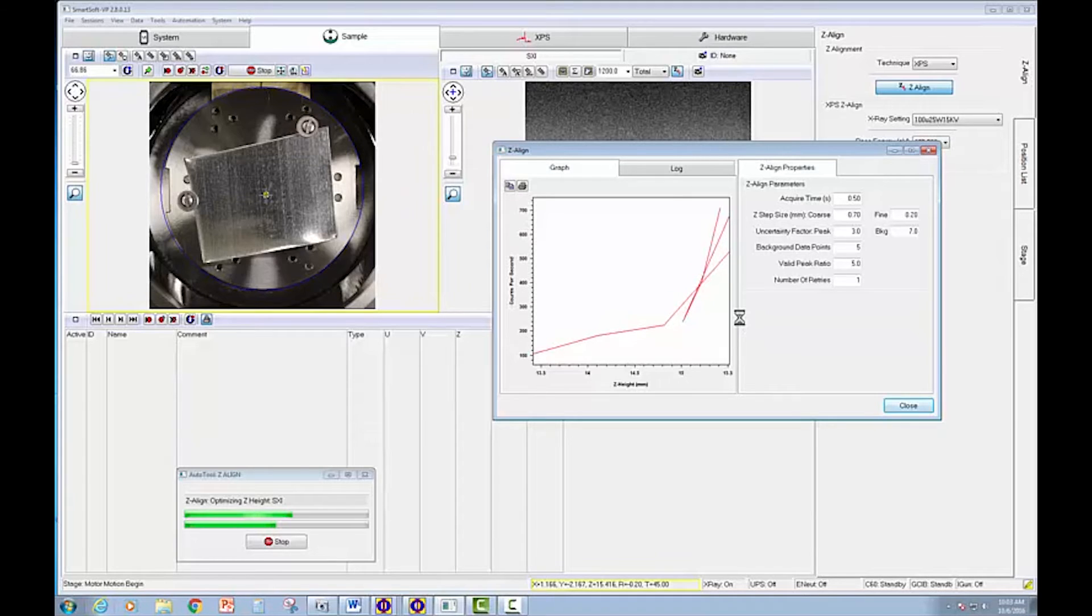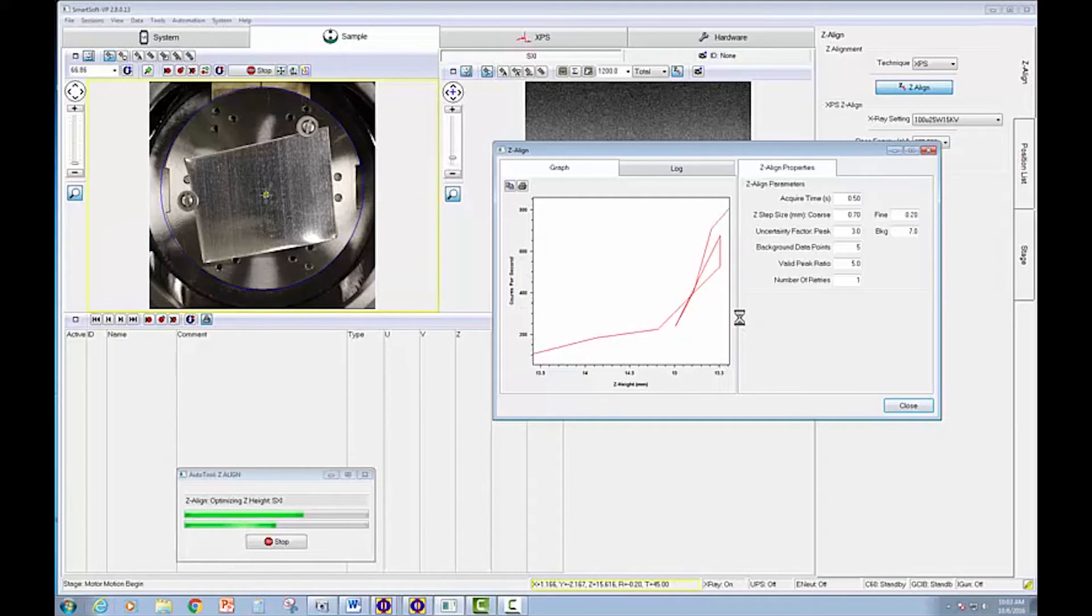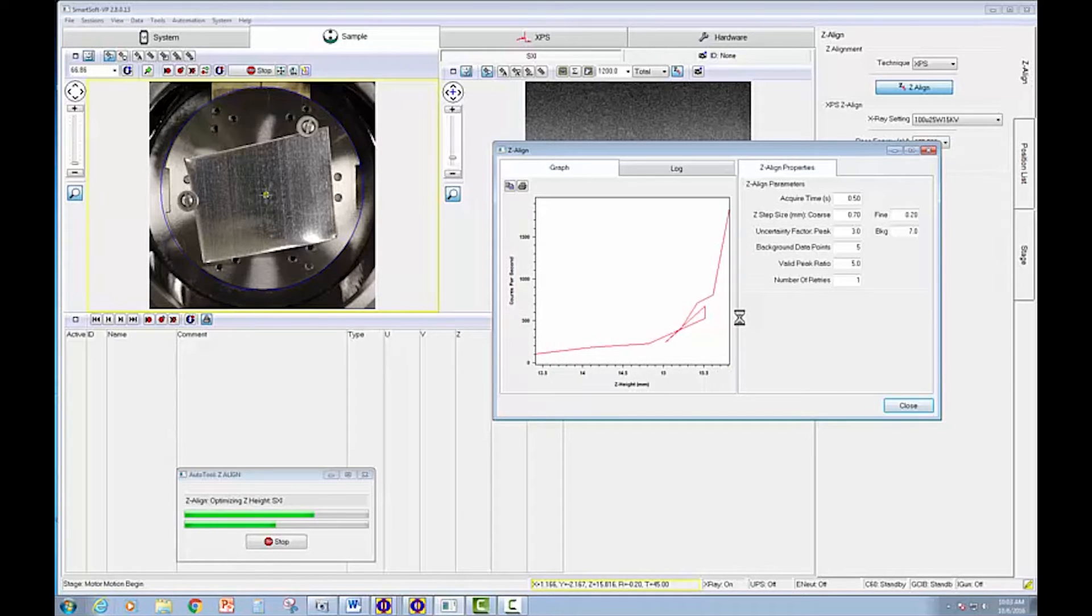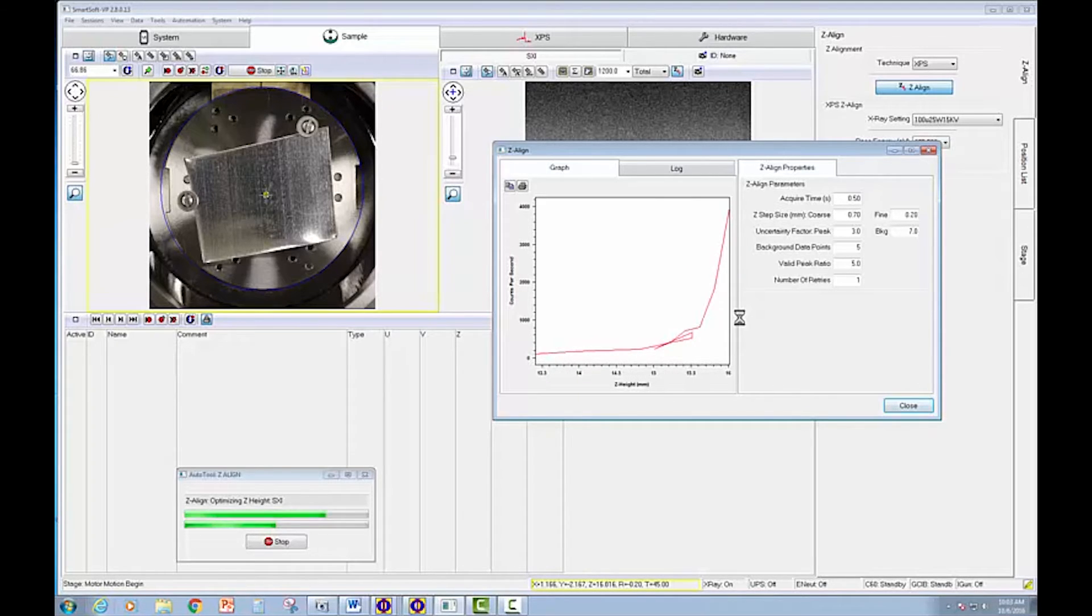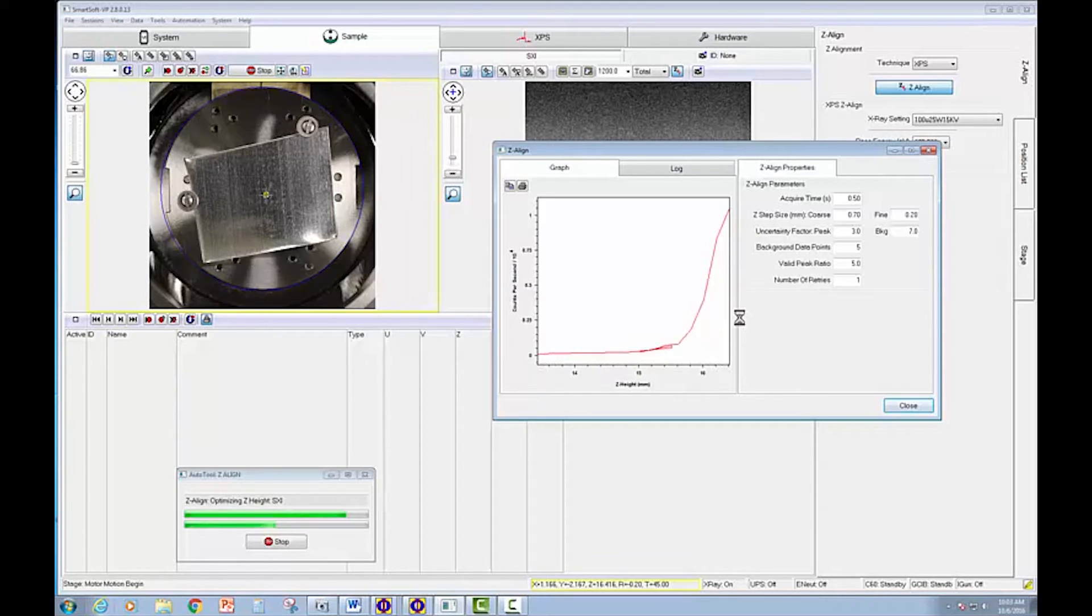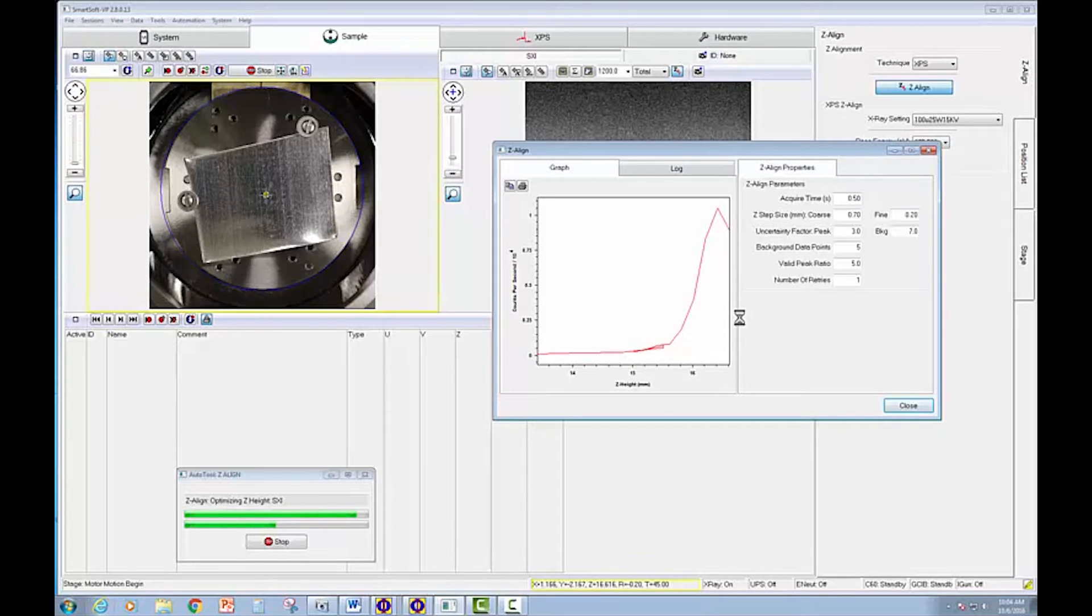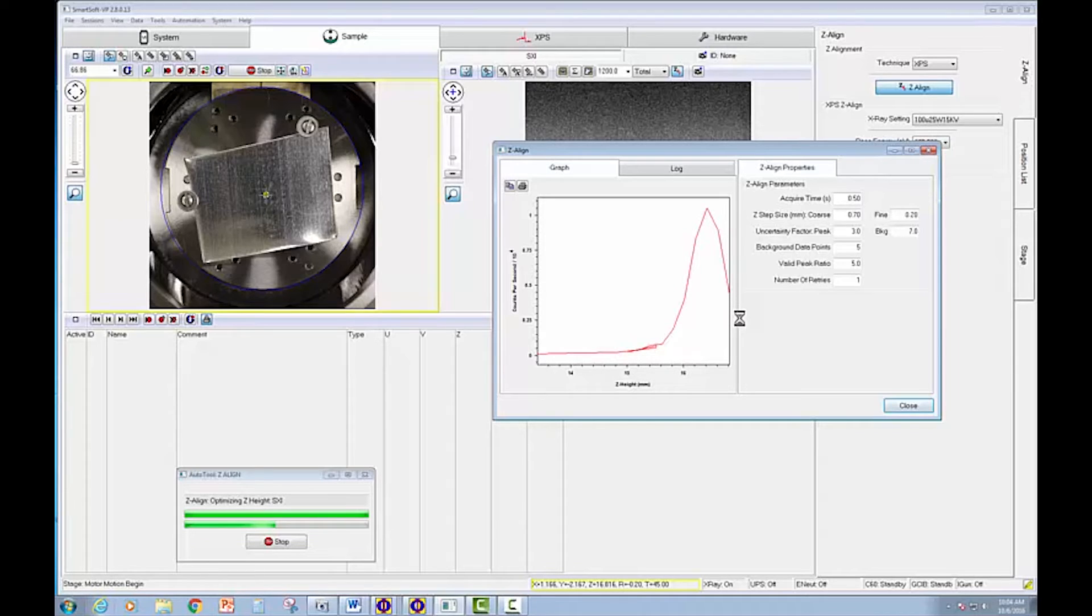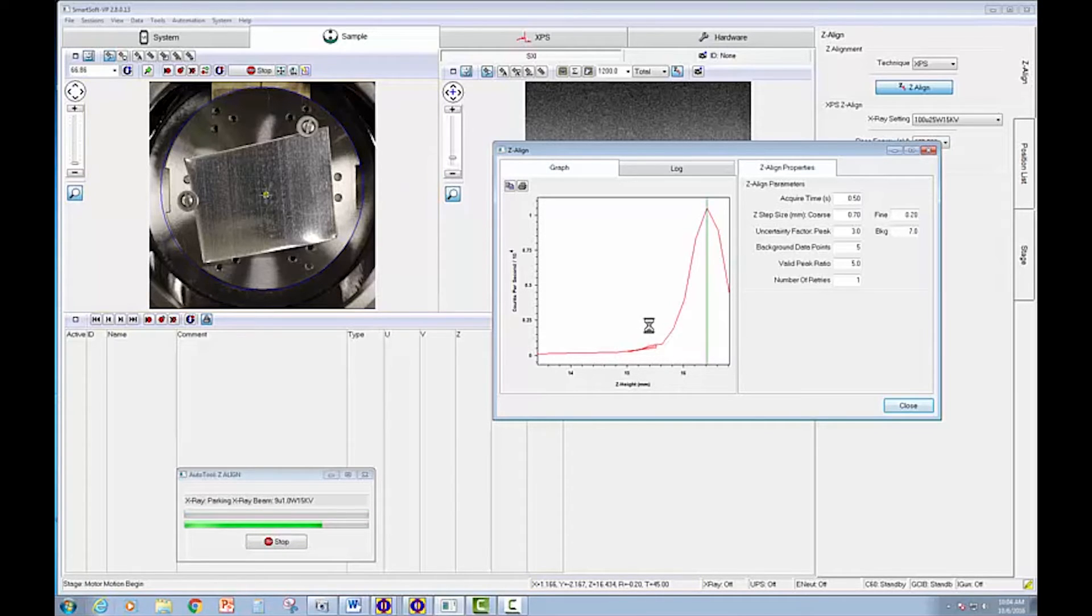Once the instrument senses a significant rise in signal, it drops back and proceeds with finer step size. You're seeing that progress now, and now we're approaching the maximum Z-height. You can see now we've gone through the peak in signal intensity, so the instrument will stop shortly and position us at the correct Z-height.